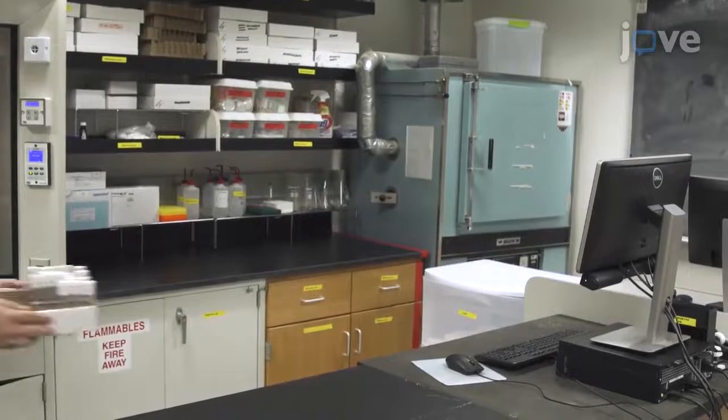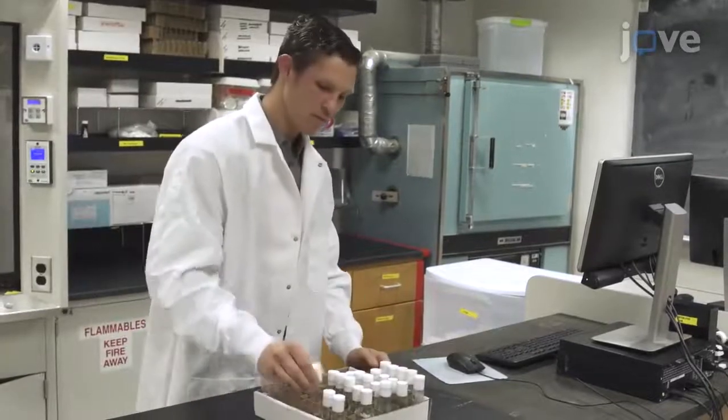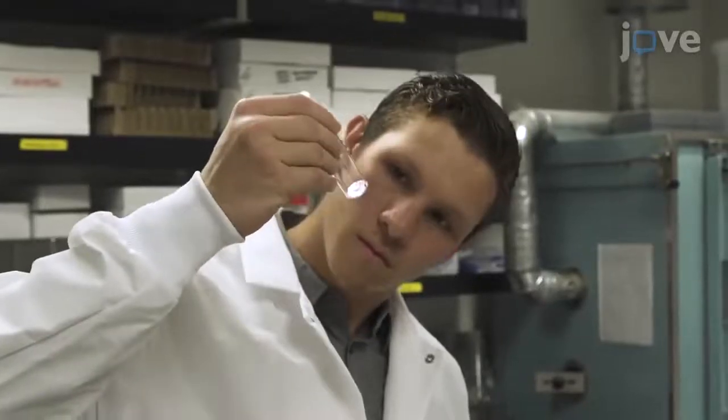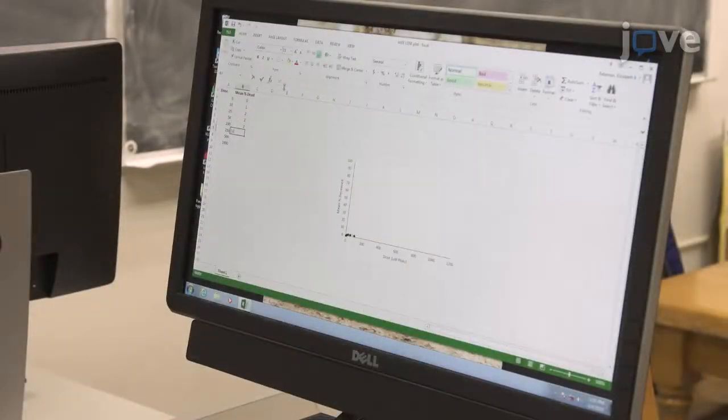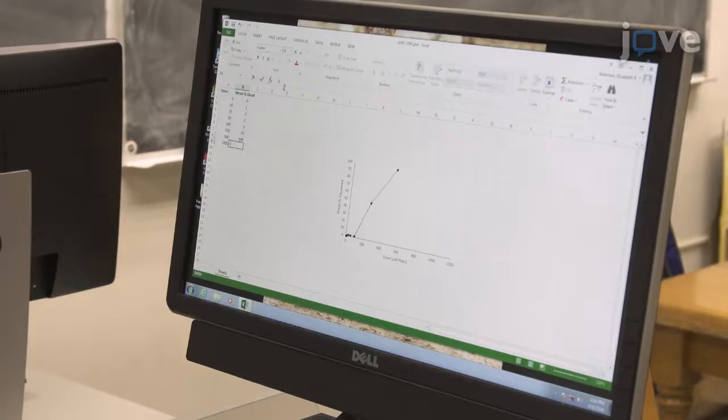To begin working with an environmental contaminant of interest, first determine the 50% lethal dose of the compound on Drosophila. Use established methods to create a dose-response curve.